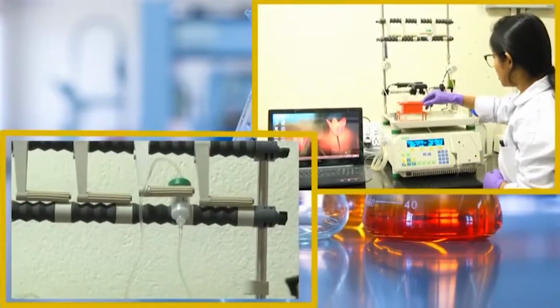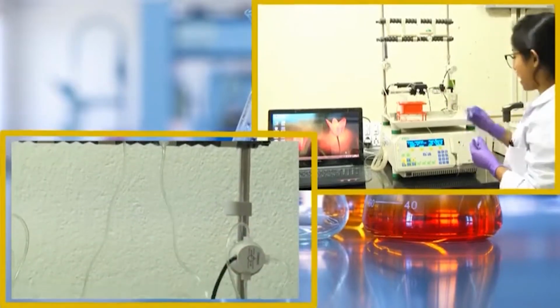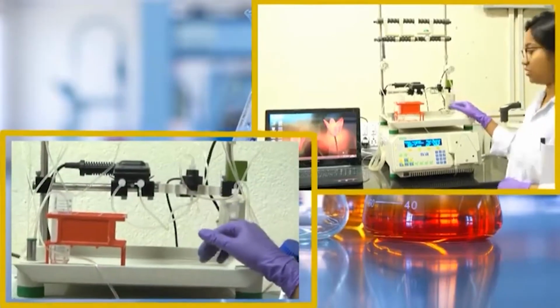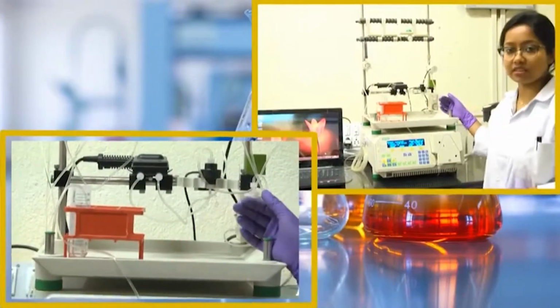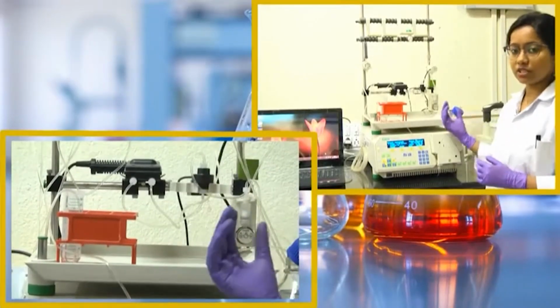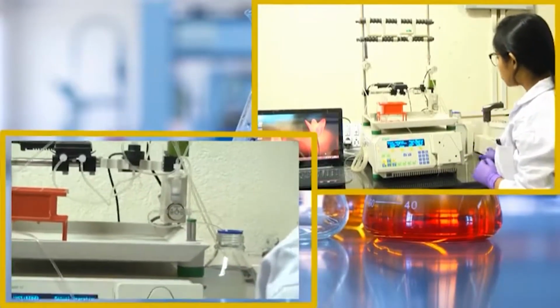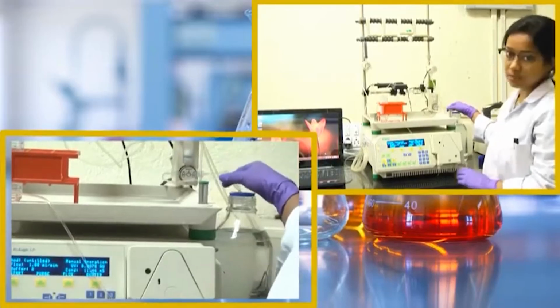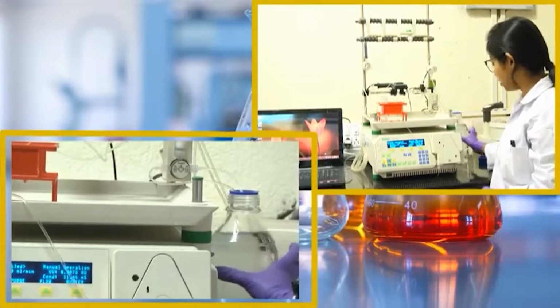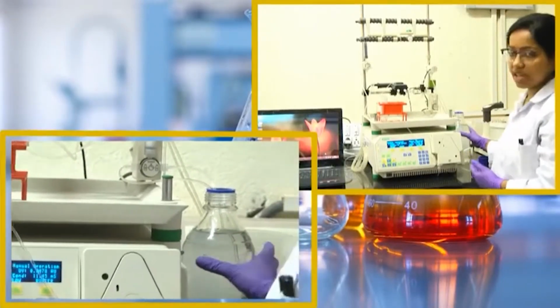As we have mentioned earlier in the chromatography lab, all the tubings and the column are stored in 20% ethanol, which inhibits any bacterial or fungal contamination. So, before we start, we need to clean all the tubings and the column with normal deionized water. For that, I have put the two tubings, buffer A and B, in a beaker or container which has only deionized water.